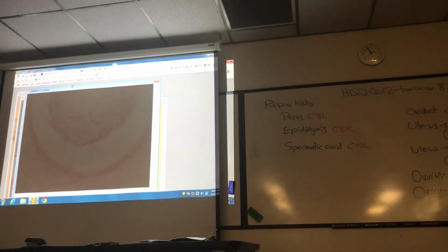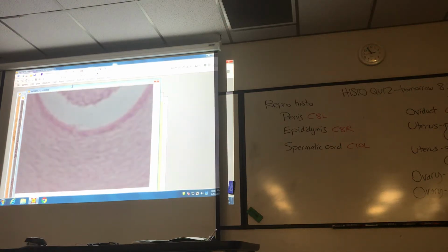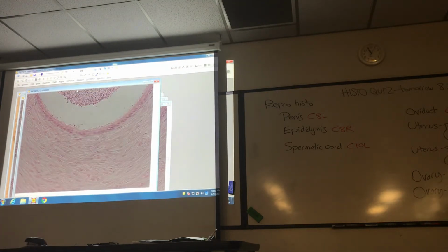So if I go to 400, that's pretty good. So this is high mag of vas deferens.